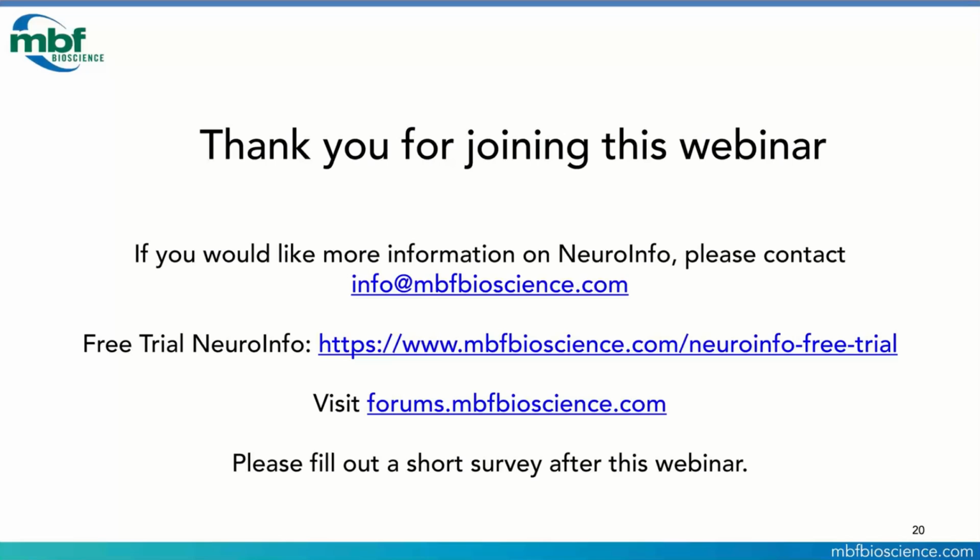This one question is a really great one. Someone asks, would love to know if it is possible to superimpose expression patterns throughout the brain from a number of reporter lines, basically overlaying them to see where they are the same and where they differ. Chip, I'm going to throw that one to you. Can you hear me? Yep, we can hear you.